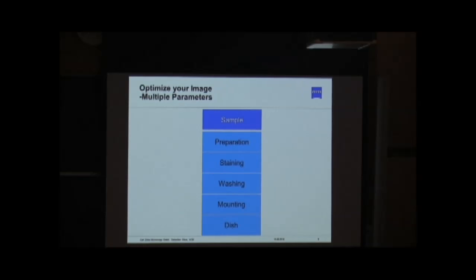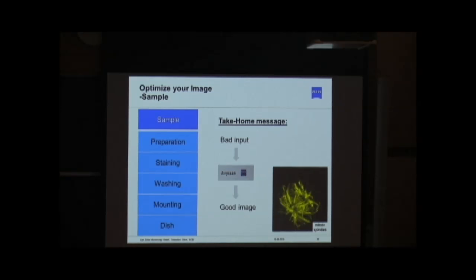I would actually like to talk about the sample in the beginning because that is something that is often neglected. Mostly people rely on a specific sample preparation protocol that was established in the lab maybe 1 year, 2 years ago, with some nice publications done with it. So people just take the protocol for granted, and let's put it in a critical way, they consider a certain protocol as a holy grail, right? So you would not really touch it and modify it.